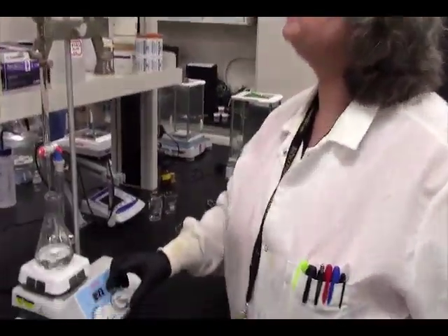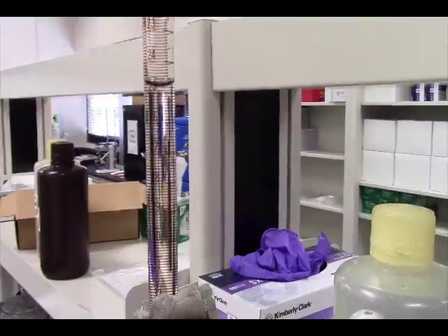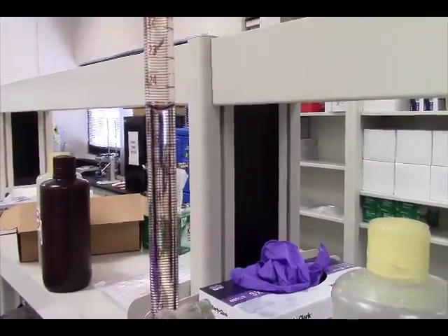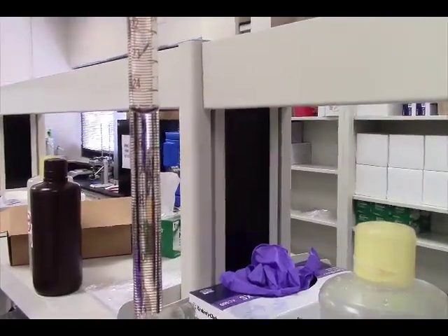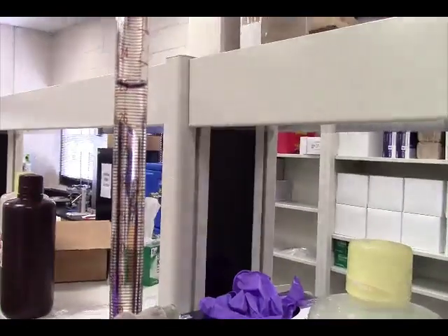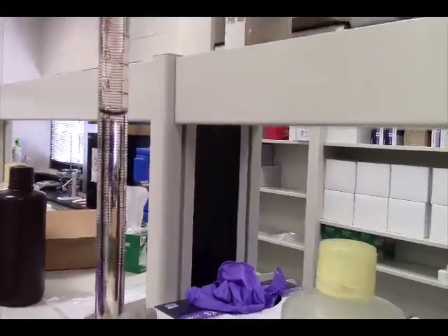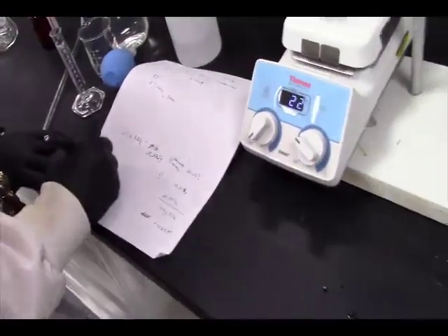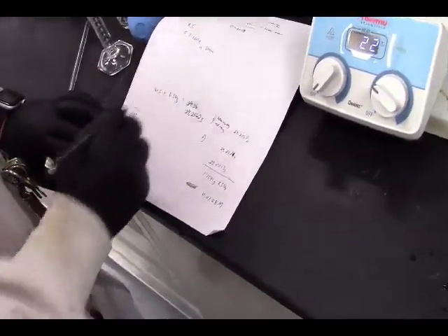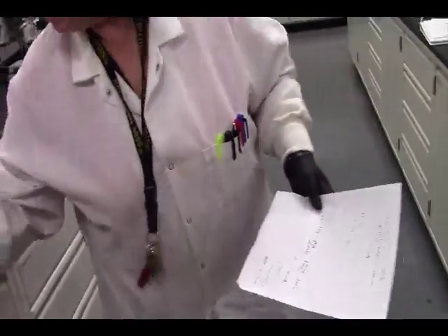We're going to read this. This is 24, 25, 26, 27, 28, 28.2. I'm sorry, 24.2. I don't know where I got 28. 24.5, 24.6, 24.7, 24.8, 24.82. So that final minus initial will give me the volume of thiosulfate that we used. Now let's go for the math.